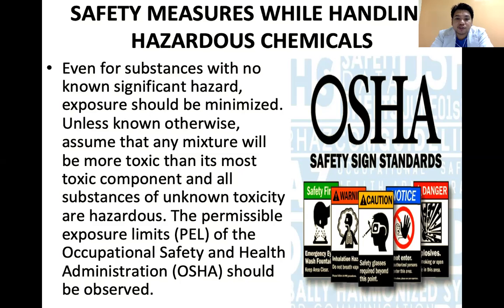Assume that any mixture will be more toxic than its most toxic component. And all substances of unknown toxicity are hazardous. So the permissible exposure limits of the Occupational Safety and Health Administration should be observed.